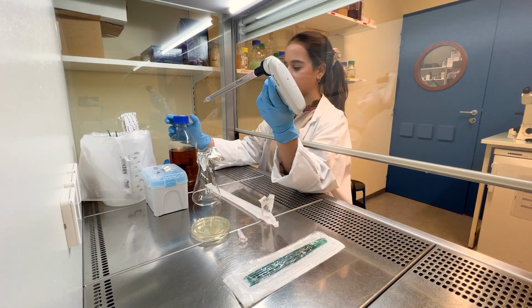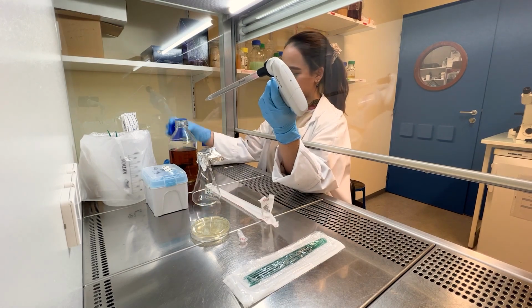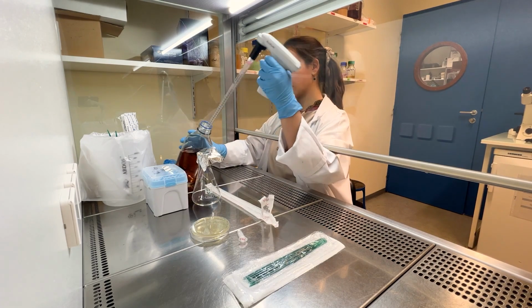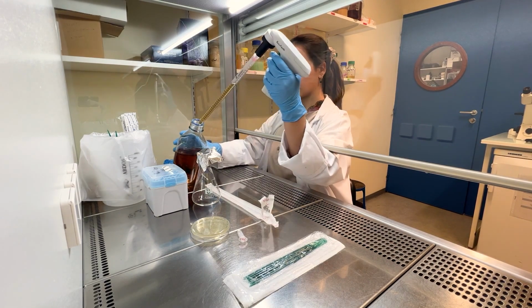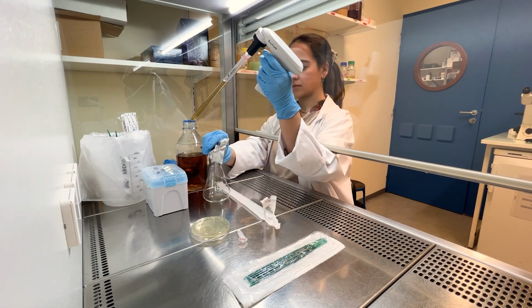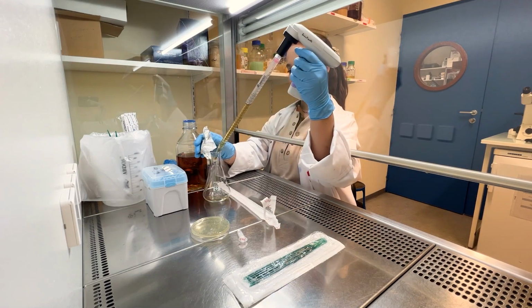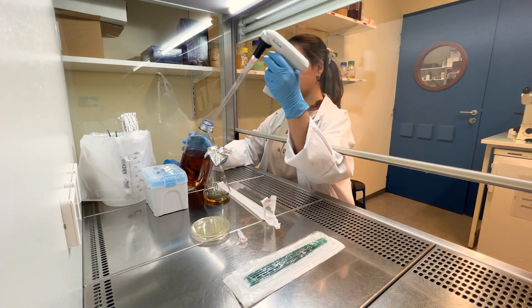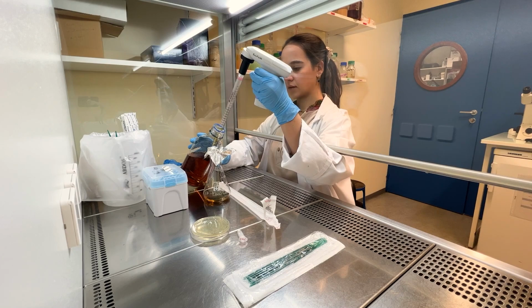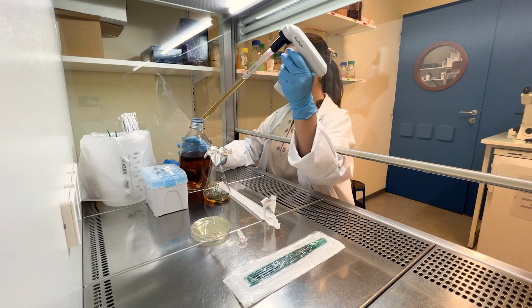Under the flow hood, we prepare a flask with 50 ml of 2xYT medium supplemented with the appropriate antibiotics. Then we pick up a few colonies from the plate and inoculate them into the flask. It's important to select a few as they may not all express the protein of interest to the same level.